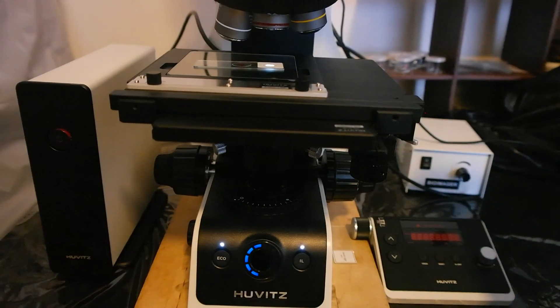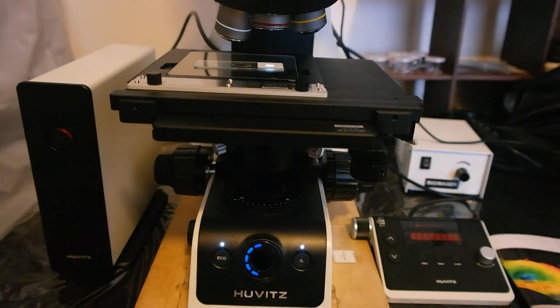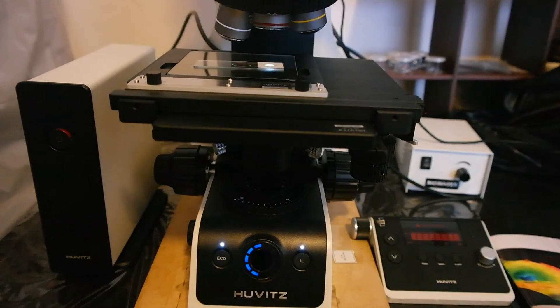And the repeatability with this one is 0.5 micron, meaning that if you travel from the lowest Z position to the highest and come back to the same position, so you have traveled 60 millimeter, then you lose 0.5 micron over 60,000 micron.